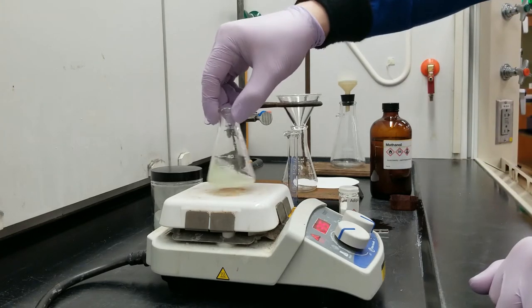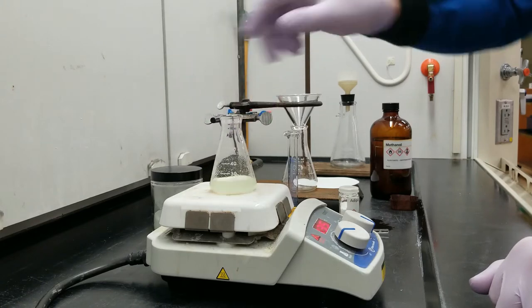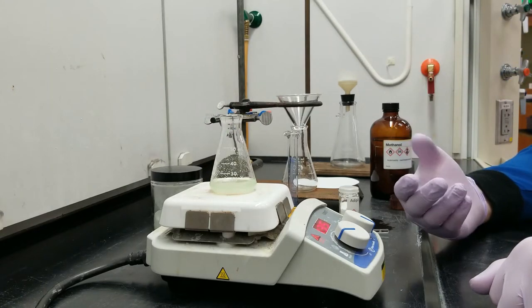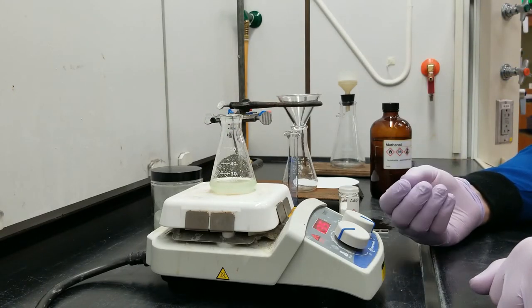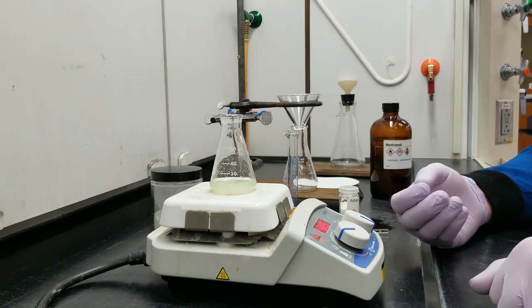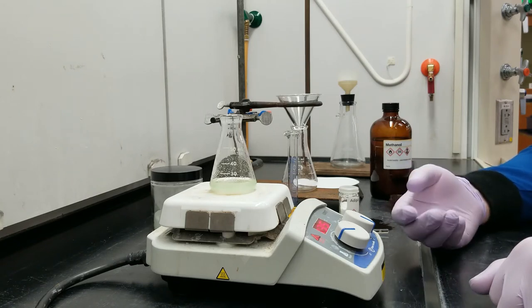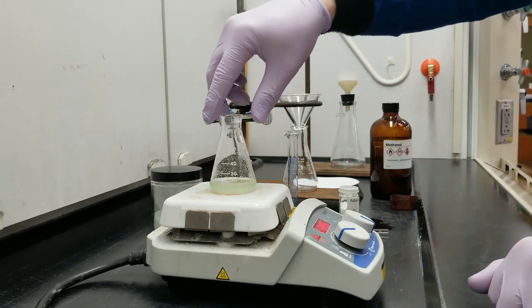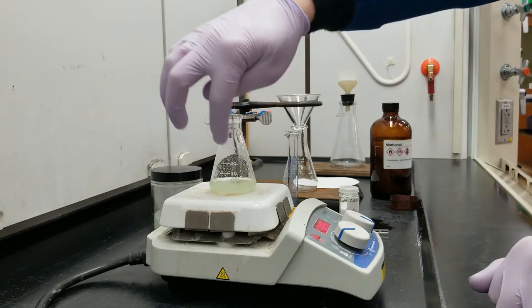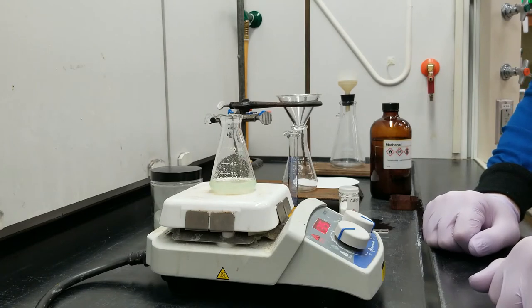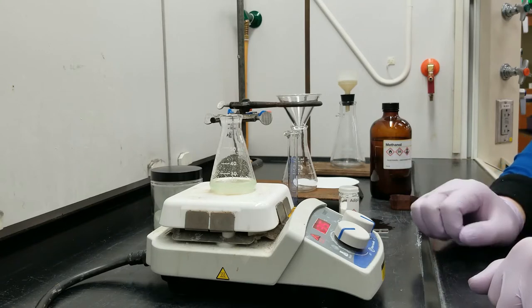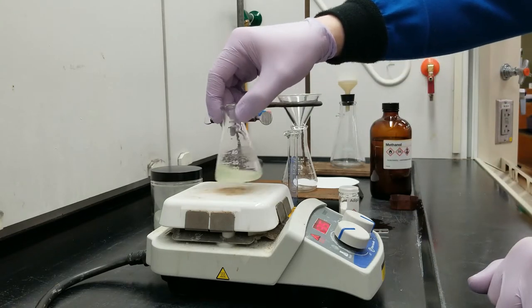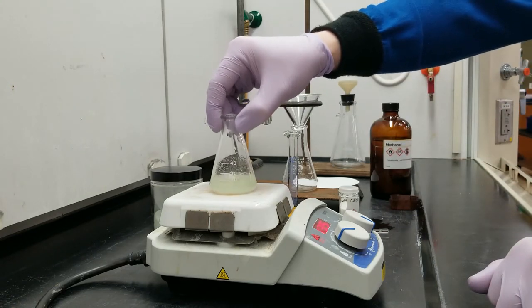By heating this up to a reflux we can make sure that when we filter this all of the adipic acid will fall through the filter along with the methanol. I've got little bits and chunks of sand on the side of my glass here and that is going to be left behind because no matter how much I heat this up that is not going to dissolve through this methanol.